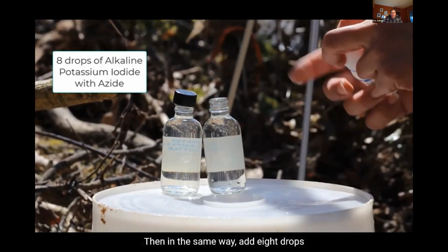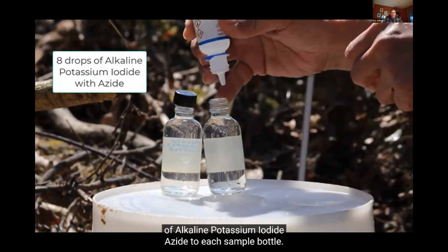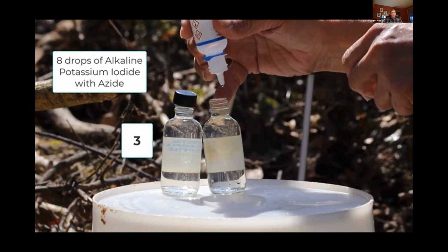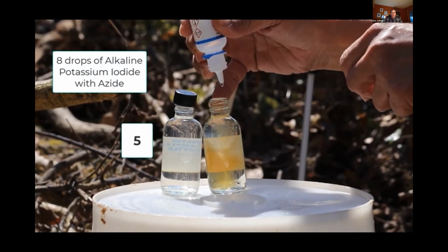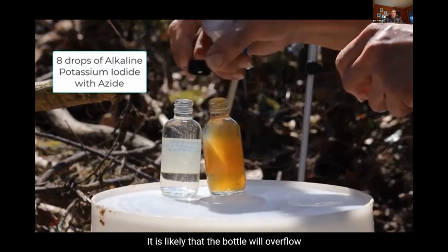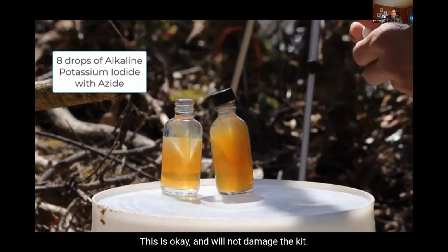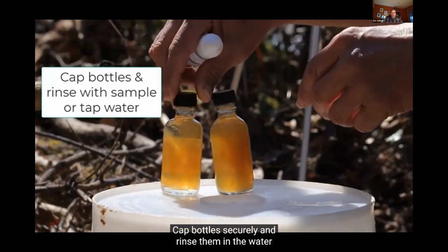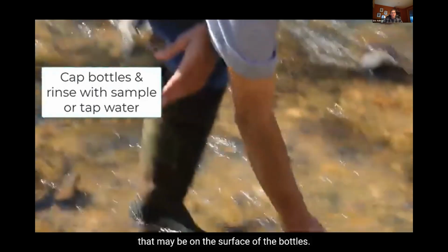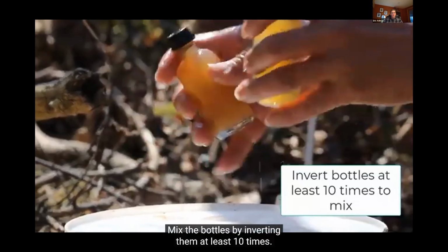Then, in the same way, add 8 drops of alkaline potassium iodide azide to each sample bottle. It is likely that the bottle will overflow as you add the reagents. This is okay and will not damage the kit. Cap bottles securely and rinse them in the water to remove traces of reagents that may be on the surface of the bottles. Mix the bottles by inverting them at least 10 times.